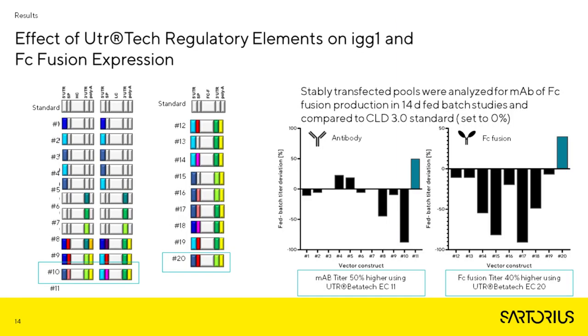And what we see here is the results of that initial screening experiment. As I mentioned before, these are the different combinations of 5' and 3' UTRs which were given by Unitargeting Research. On the left-hand side, I have all the different combinations provided for double-chain proteins, and on the right-hand side, those combinations for the single-chain proteins. In summary, we had in total 3 different 5' UTRs, 3 different 3' UTRs, 3 different signal peptides, and a poly A that we tested in different combinations.